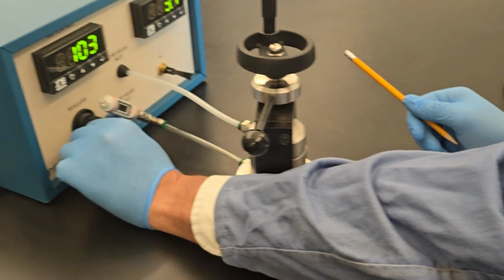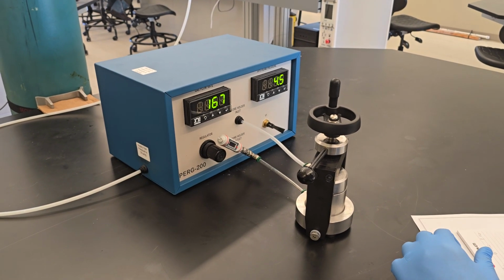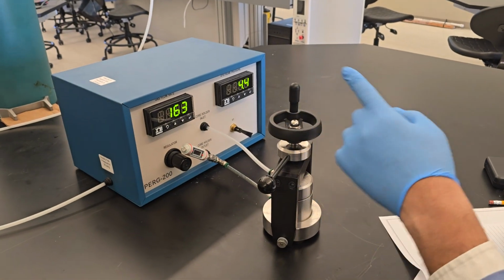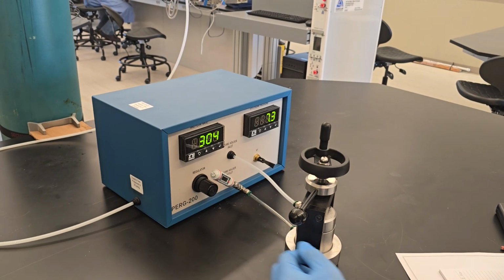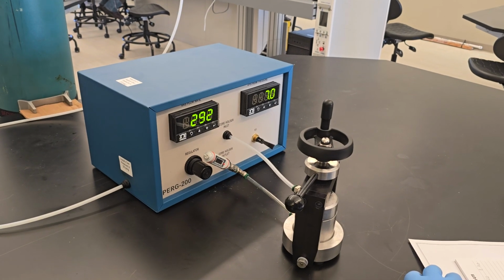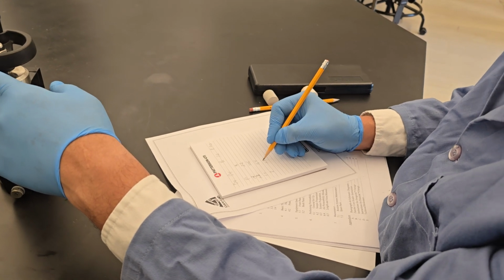All right, then I'll push it up a little bit. Okay, 4. 4.5, 164. Okay, 4.5, 164. All right, I need 2 more data points at least. So I got 7.2. Okay, now we reach some stability. So 7, 292. Okay, it's good. 292, 293, 292.